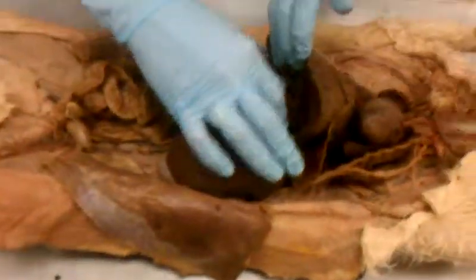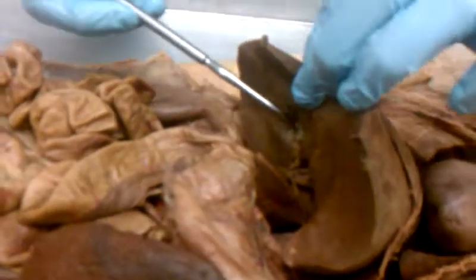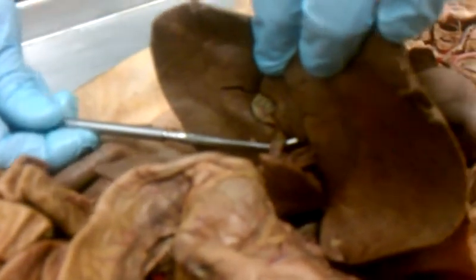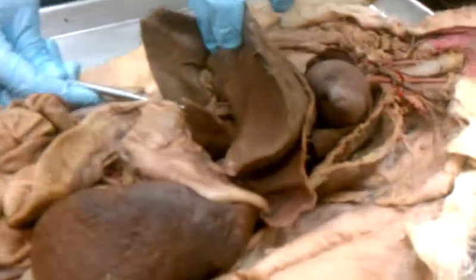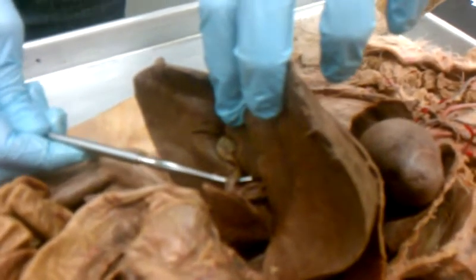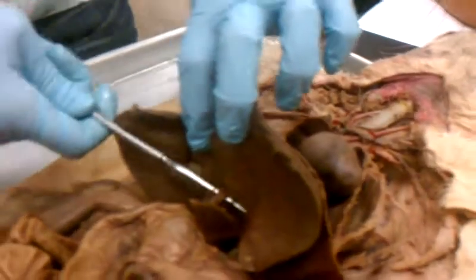And then you have, let's see, your ducts. Okay, so then you have your ducts. These are not dissected out. I was trying to dissect them out on here, but they're not totally done. So, if you see, here's your gallbladder, the little bubble, and there's this duct right there coming out of it. That is your cystic duct, if y'all need to see, reach around. So the duct that comes out of the gallbladder, this is your cystic duct. And then you have ducts that come out of the side of the actual liver. There's 2 of them.